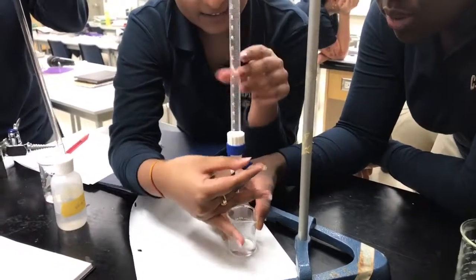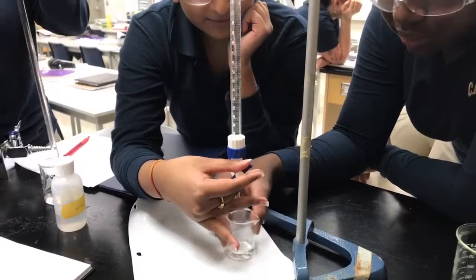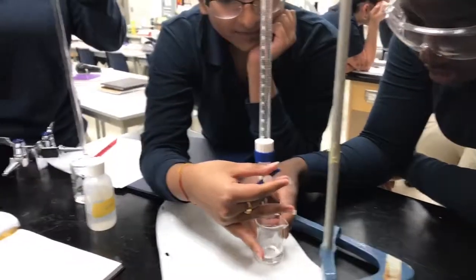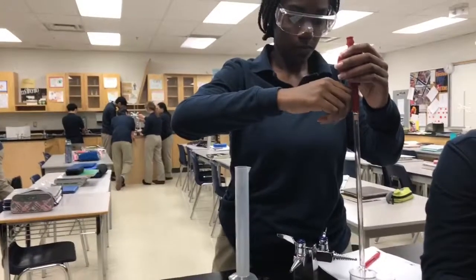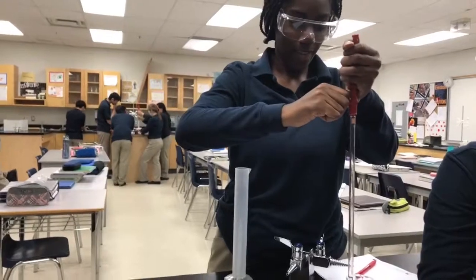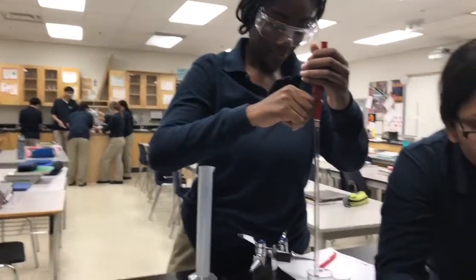Wait, did we record where it was? Yes. 17.2. Hang on. I think you're supposed to touch the bottom. Are you getting it out? Slowly but surely. It's taking a while. There you go. Okay, back to the titration.